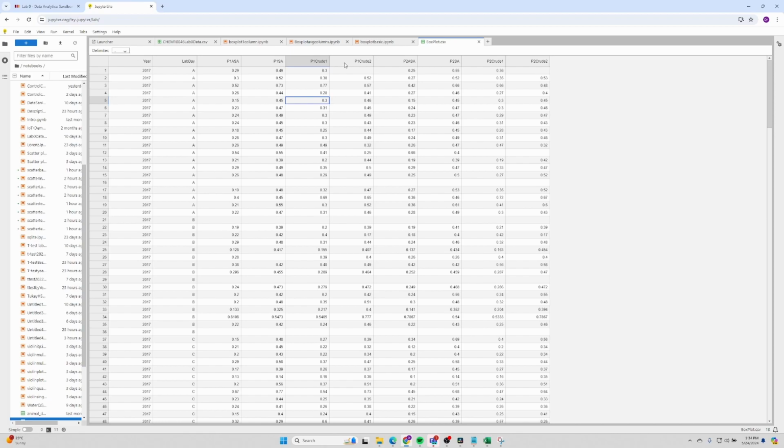We collect the data, and now we run a box plot to see and compare the data. So I want to compare 4 columns worth of data. We can go here to box plot average columns, but note here that I've got 2 different plates. So this was one plate that was run. So literally a TLC plate, I spotted pure ASA, I spotted pure salicylic, I spotted my crude, one spot for this. It got separated into 2. So this is plate 1, but I did a second plate to be redundant, and so this is the data from that. What I'd like to do is actually average the two plates before we do the box plot.